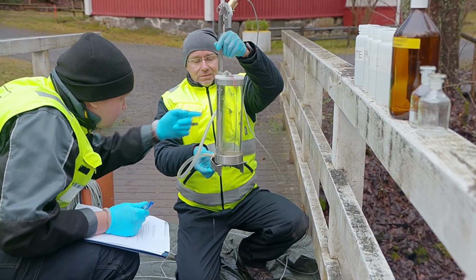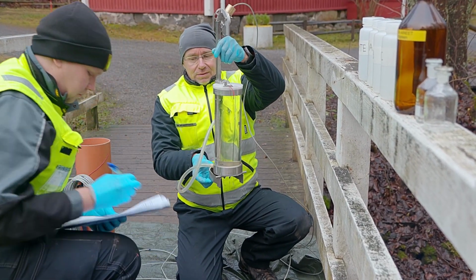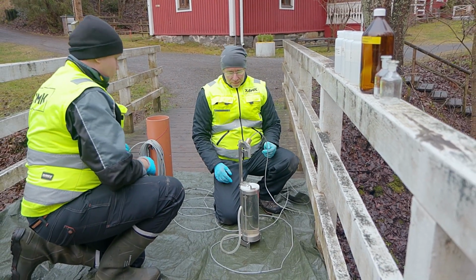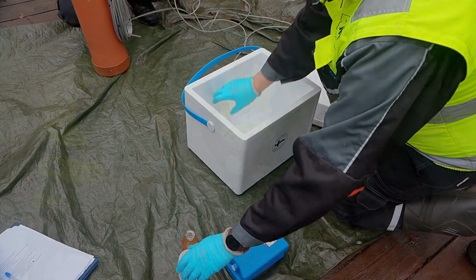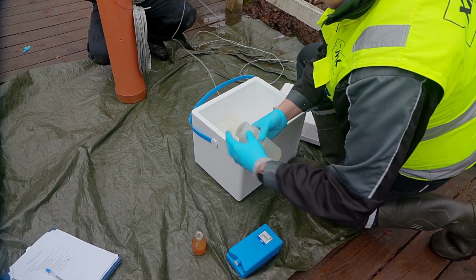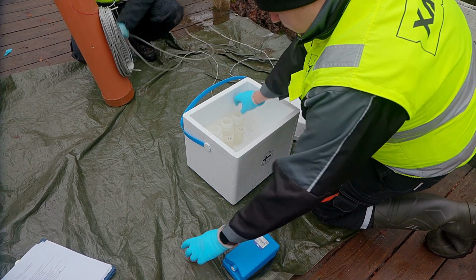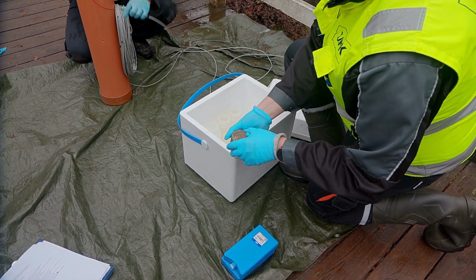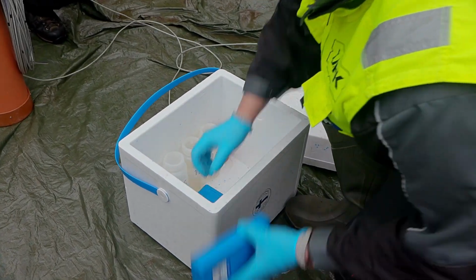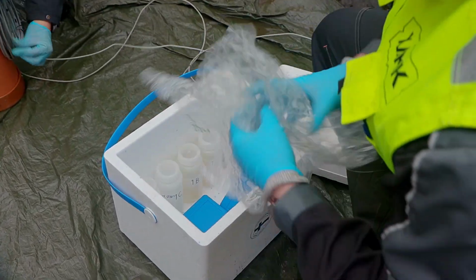After sampling, the samples should be stored and transported appropriately. Sample containers should be padded to avoid breaking and protected from light and temperature variations. A good way to protect and transport samples is a cool bag with enough padding. The analysis form should also be placed directly inside the cool bag. This ensures that the laboratory will know what the samples are and what analysis should be done.